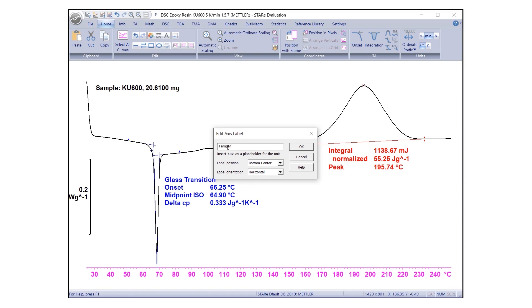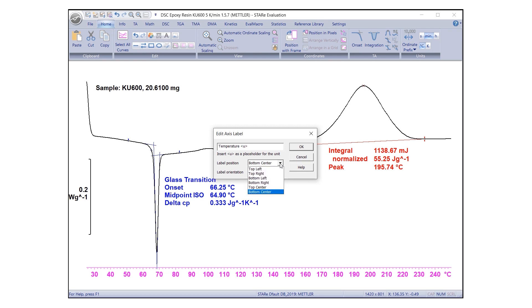To include the unit of the quantity on the axis, insert the characters at the desired place in the text. If not specified, the unit will be added at the end of the label. The desired label position and orientation can be selected from the drop-down list.